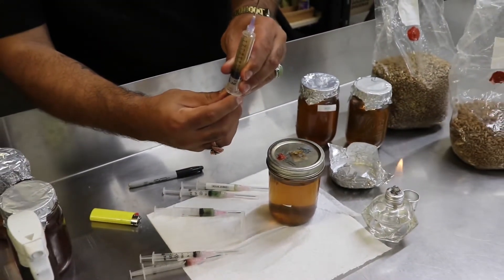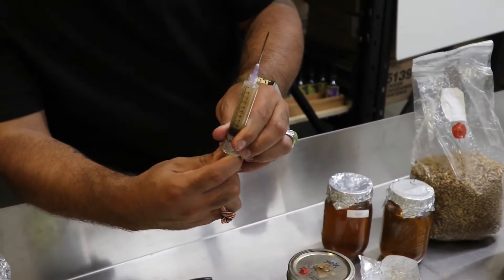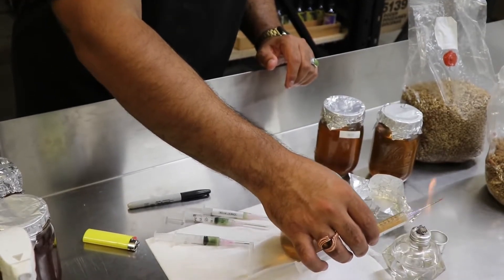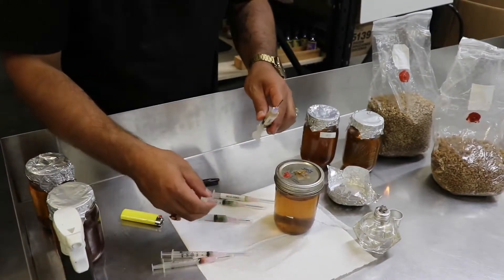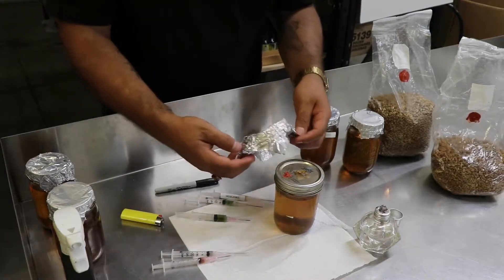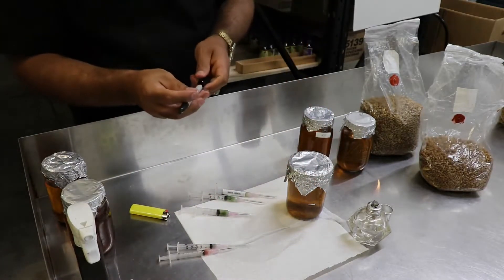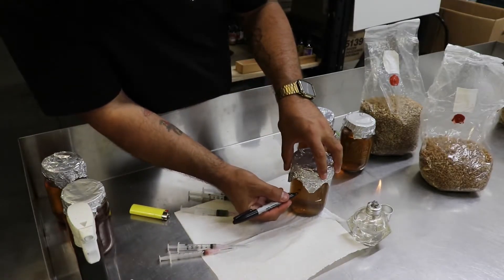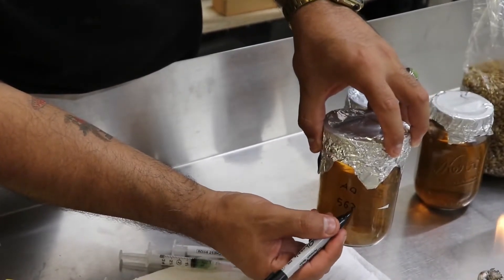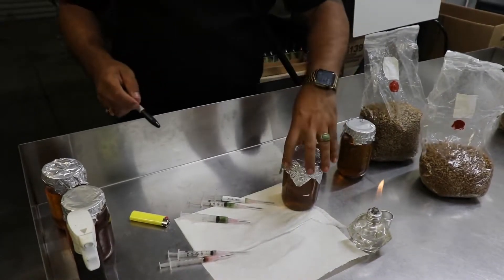Now you want to suck the liquid that got stuck in the syringe back down until it reaches the top of the needle. Once it's at that point, re-sterilize your syringe with the hot flame, then put the cap on quickly so it doesn't melt and let it cool. Always put your foil back on your liquid culture so no contaminants fall in — and they will fall in if you don't. Then label it: this is my almond oyster, so I'll put AO and the date 5-6-21. Label the liquid culture and put it away.